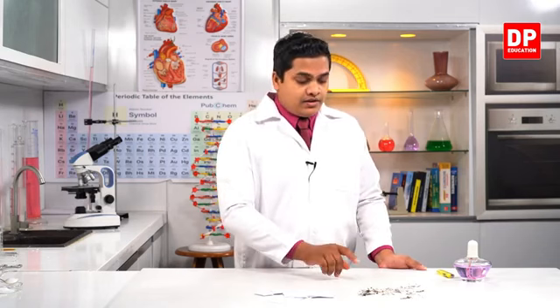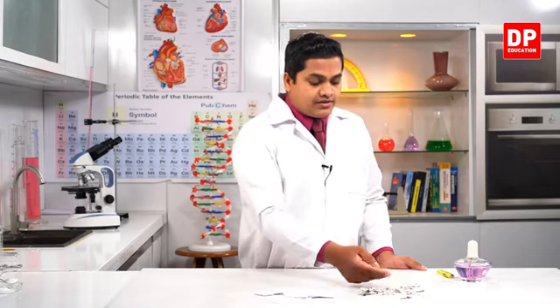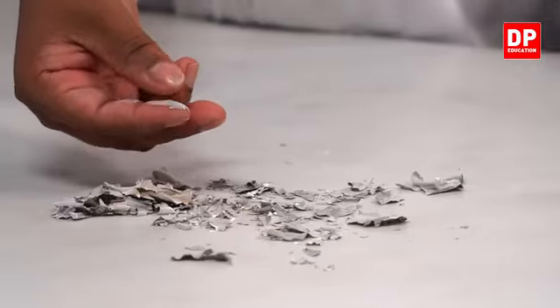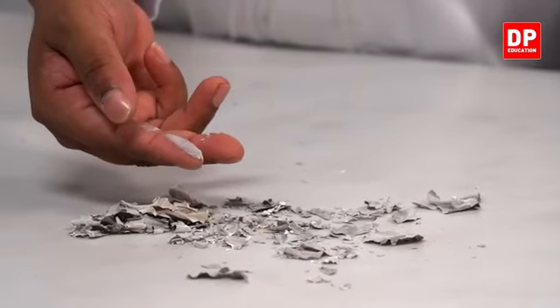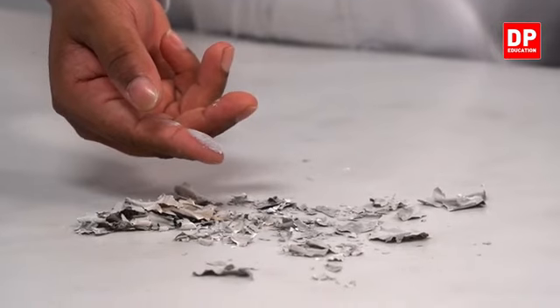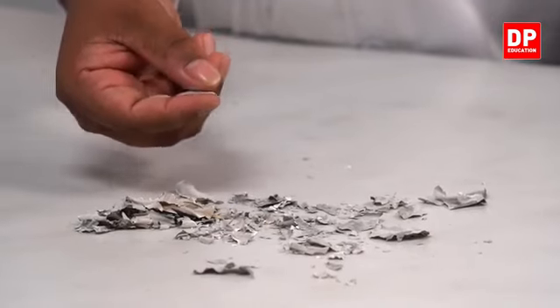And if I touch these things, you can see here, a very small powder has been created. So it's very clear to us that after burning this paper, different substances have been created, and these substances are not the same as the previous substances.